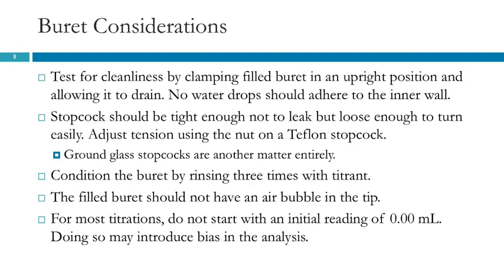There are other types of stopcocks. The older style is a ground glass stopcock. So that's going to look kind of like those glass stoppers in the volumetric flasks. It's been ground so that it fits perfectly inside of the burette. Ground glass stopcocks don't have a nut or anything to keep them from popping out. So that gives rise to another set of problems of exactly how you hold the burette. They are typically lubricated with a type of grease to facilitate them moving easily and not leaking. But if you need to know about those, you can learn about those later.